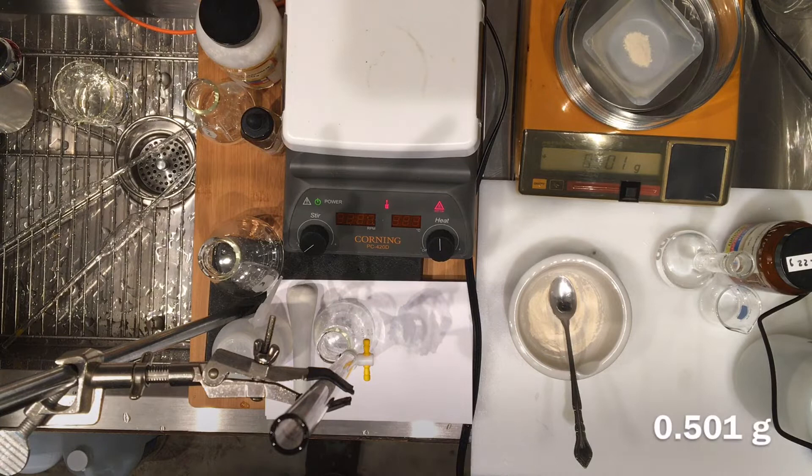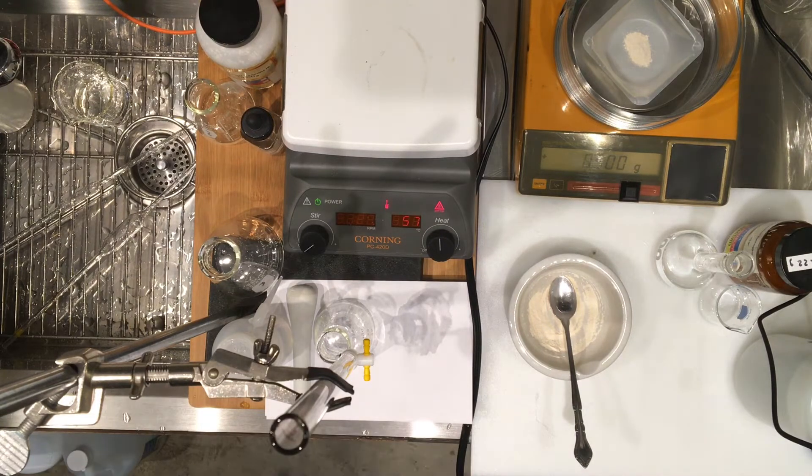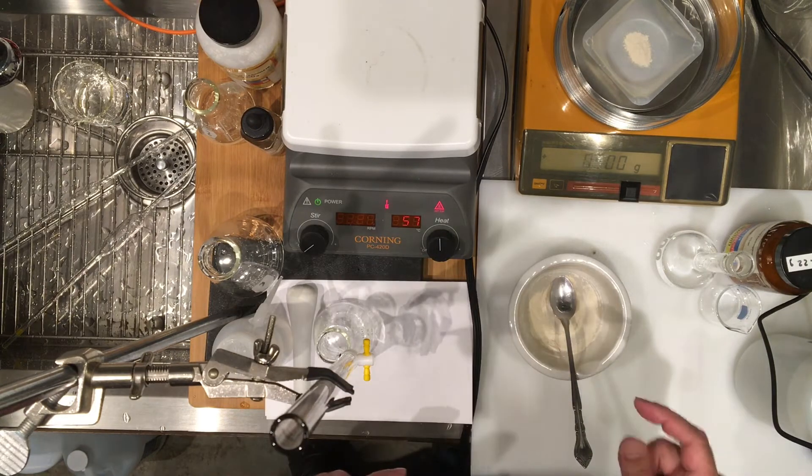So for our first titration, the mass of the impure vitamin C sample is 0.5 grams — I just got lucky to get it exactly to 0.5. You don't want to get these masses exact; you just want to get them approximately the same value and move on. Record the first mass as 0.5.